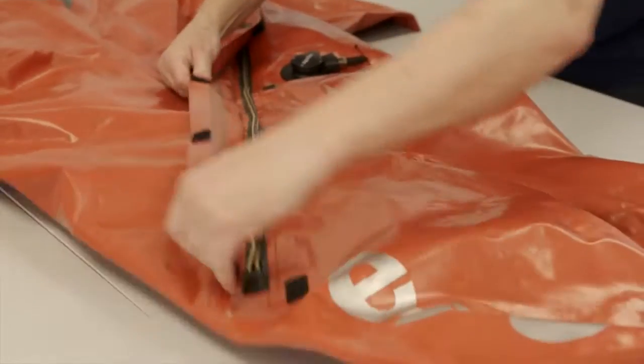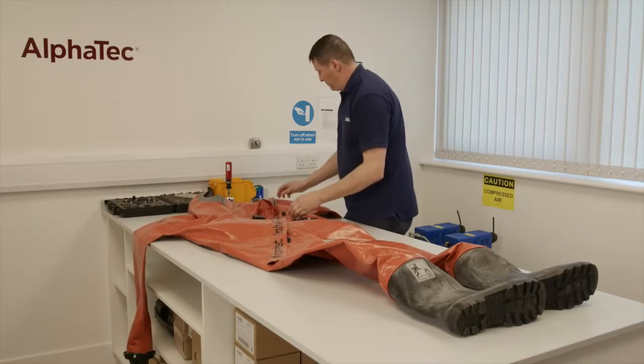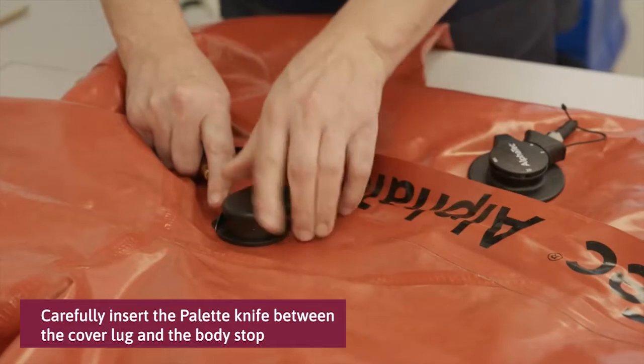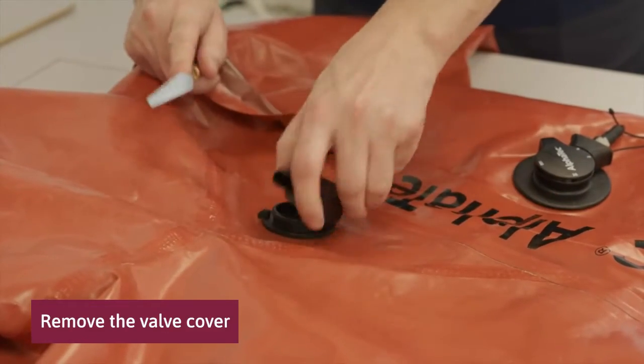Open the zipper fully to prepare for later. To remove the outer valve cover, first rotate the cover clockwise so the cover lug is 6-8mm past the valve body stop. Carefully insert the thin blade pallet knife between the cover lug and the body stop, then turn the valve cover anti-clockwise and remove.